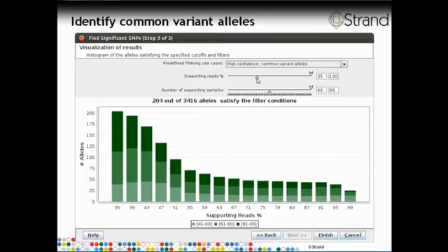It allows you to customize the colors. In this particular case, the clustering was done based on the percentage of supporting reads. The minimum color blue was set to 0, and the maximum color red was set to 100, with 50% being the yellow color. So let's look at smaller parts of this clustering view to get a better idea of how to interpret this data. The first view shows a part of the sample tree.